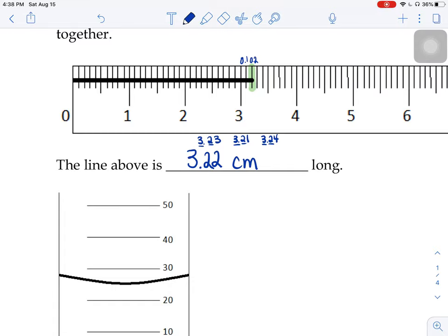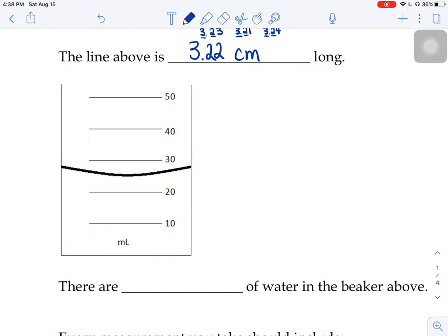Let's try the next one using the same ideas. So this beaker with the water in it, if this right here represents 20 and here's 30, we know that it falls somewhere between the 20 and the 30. We know it's not quite at 30 yet, so we know it's 20-something milliliters. Now, the something is our uncertain digit. We all agree on the 2, we know it's bigger than 20, but how much bigger than 20 it is is where we might disagree. Now I'm looking at that, and I think it's just a hair past halfway. So I think it's 26, and my units are going to be milliliters. I think it's 26.